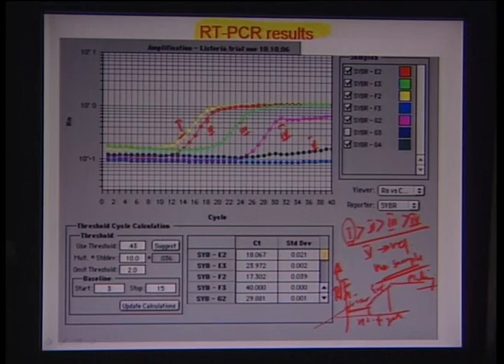What happens here is that in this region there is very little primer or enzyme or other molecules available, because this is a diffusion limited regime. Diffusion has not fully taken place. So getting micro on this would mean that this number of cycles would be compressed more towards the left. The exponential is the area where you have almost all diffusion complete.